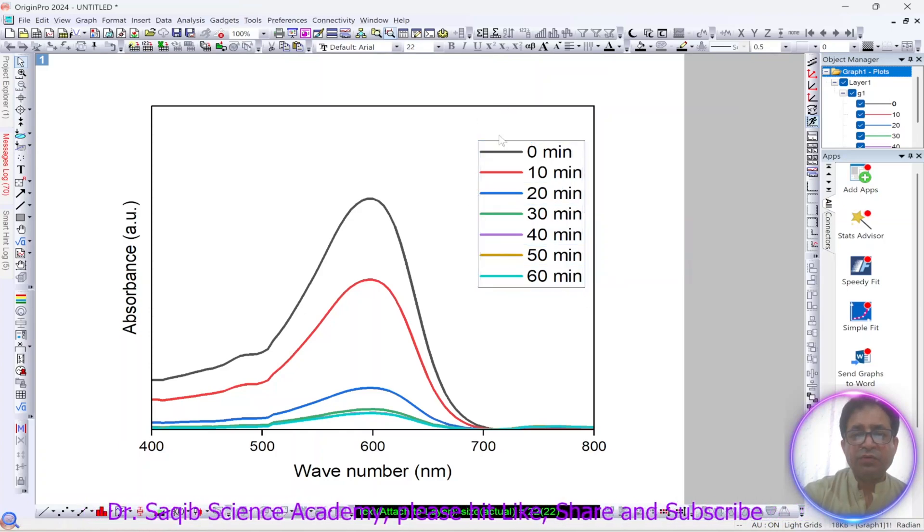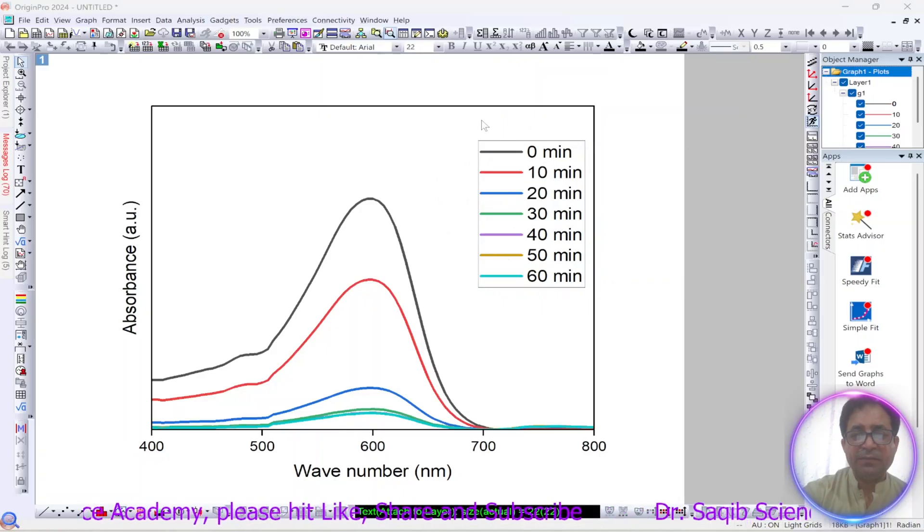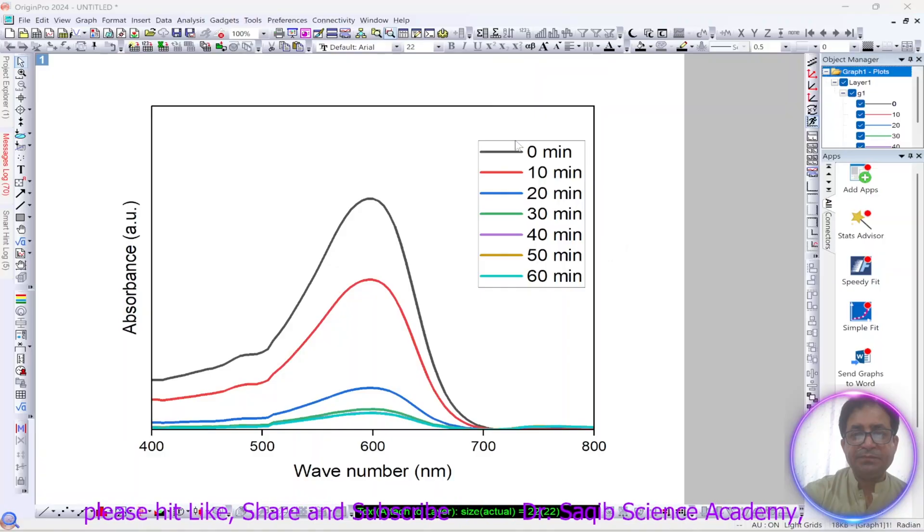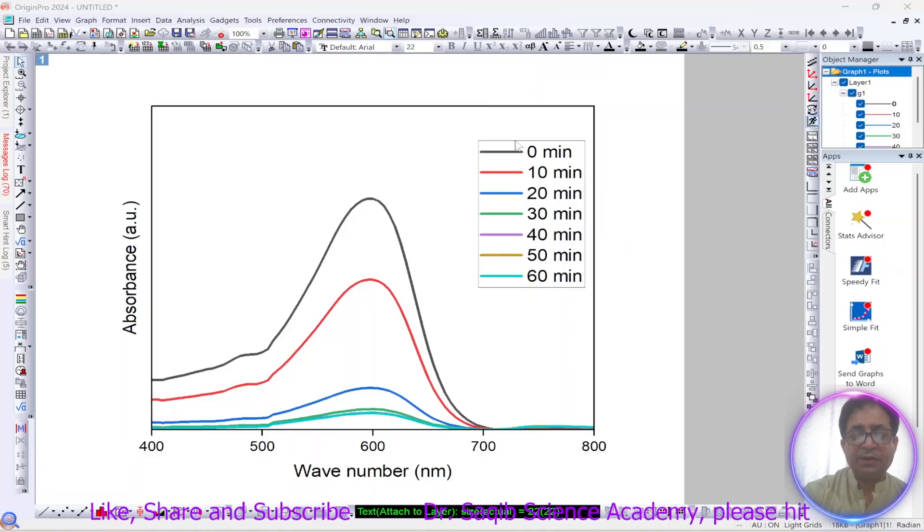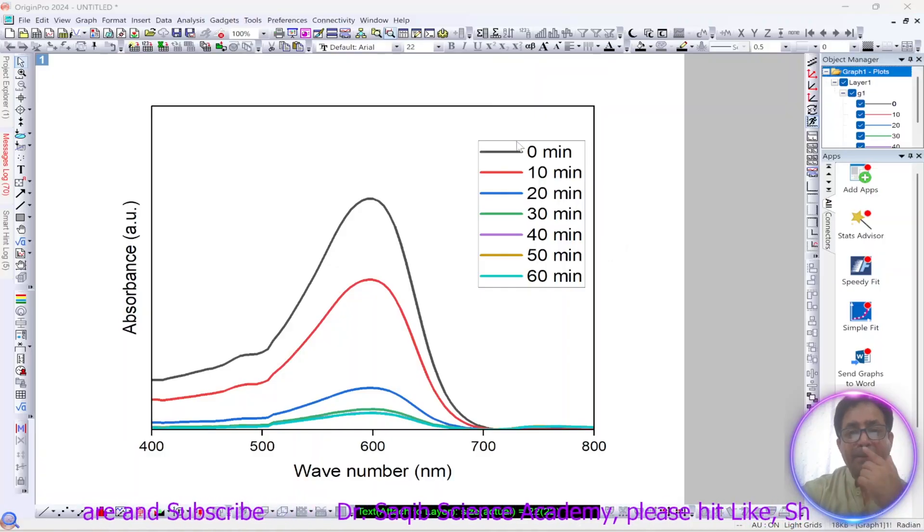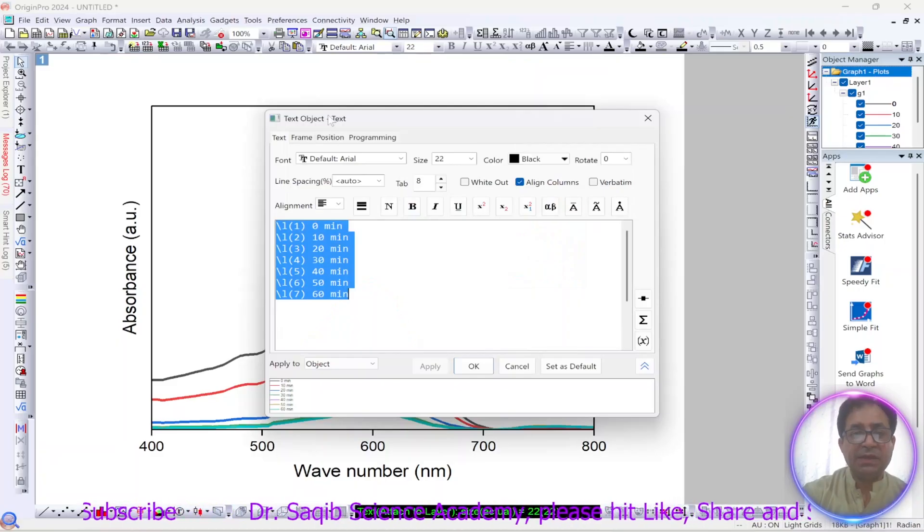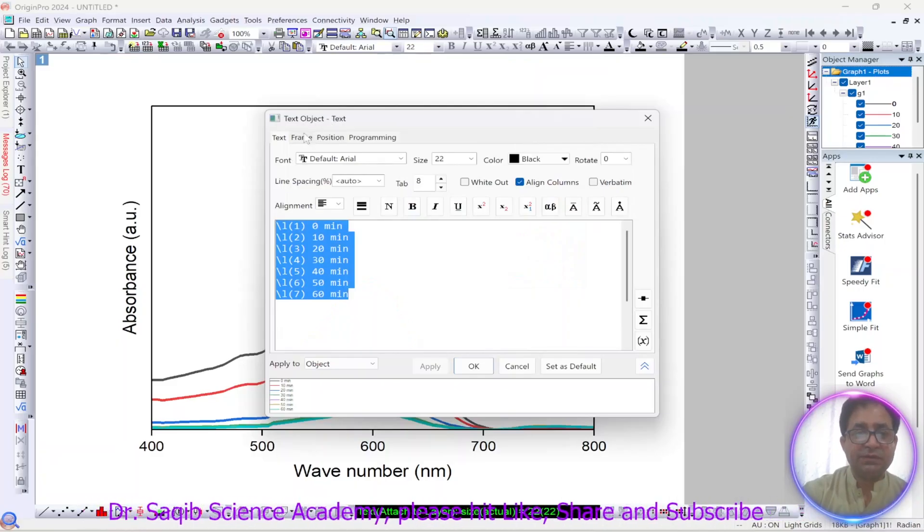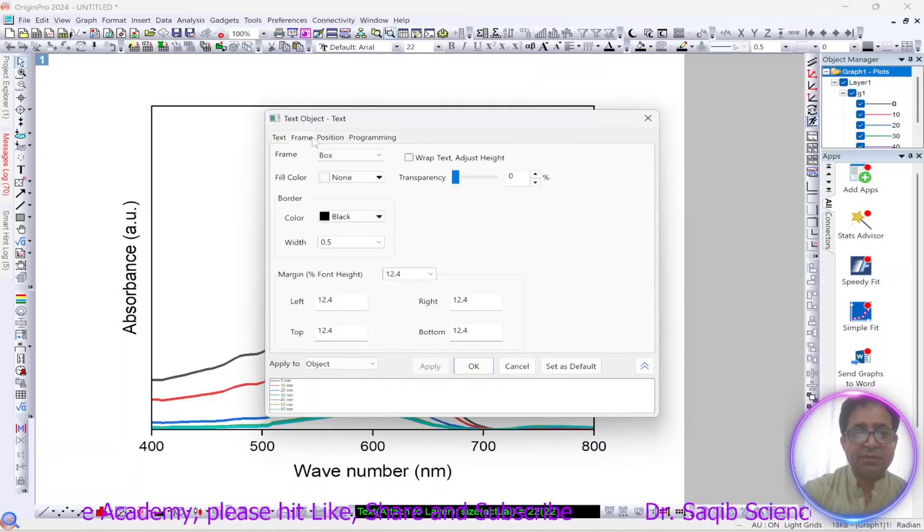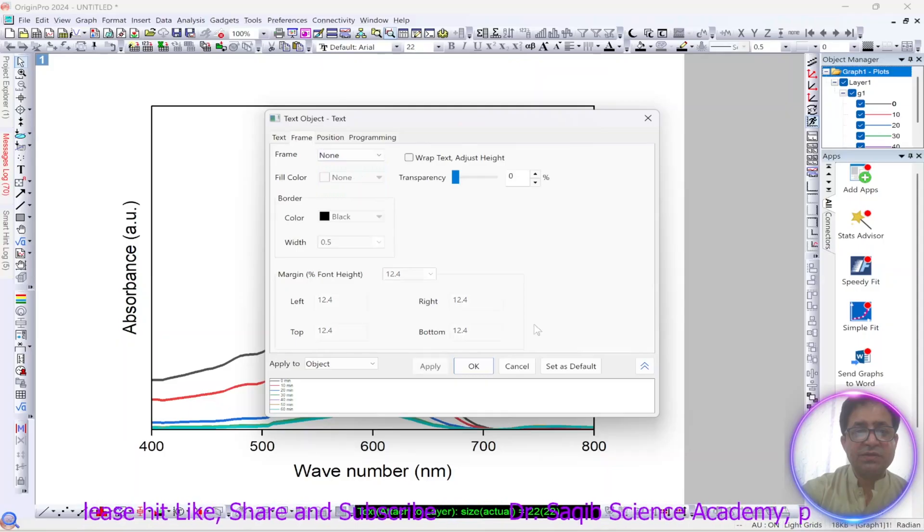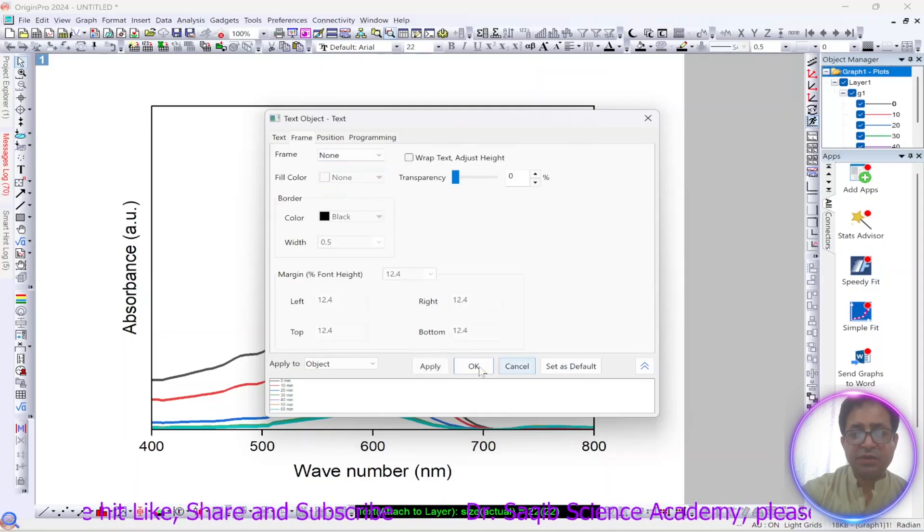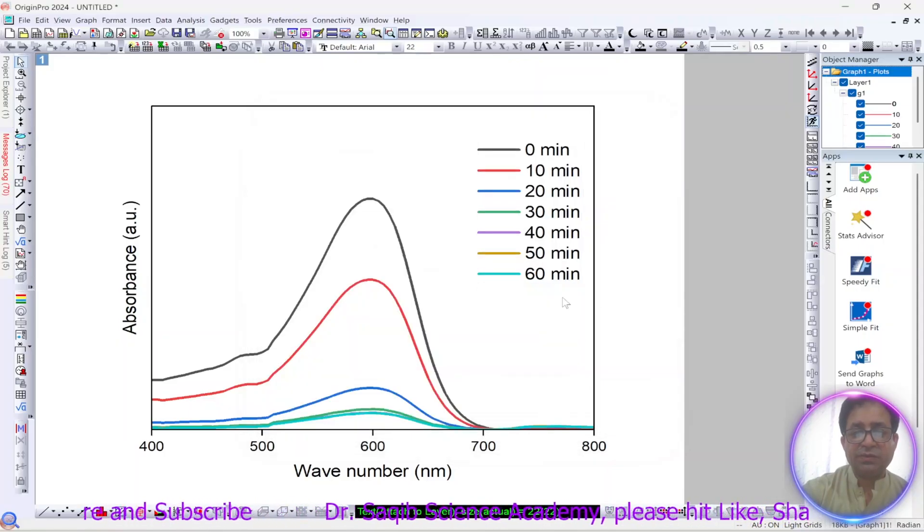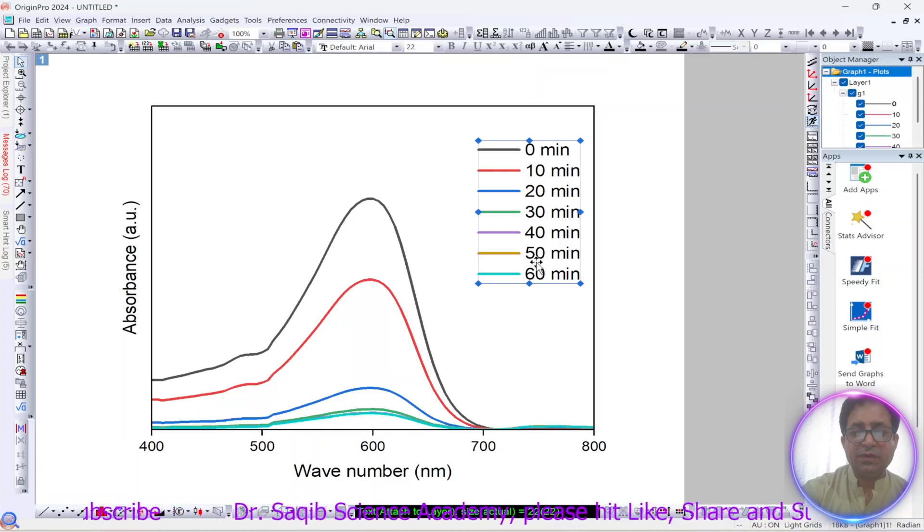If you want to remove the frame from this, right click, double click, and then after double clicking it will show you this kind of text object frame box. So over here you just put none and okay, so the frame will be removed.